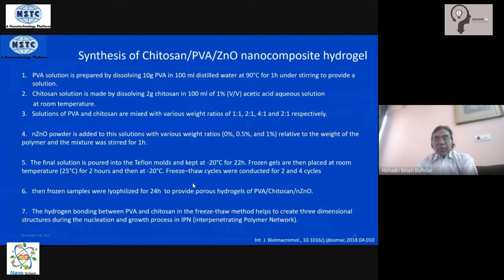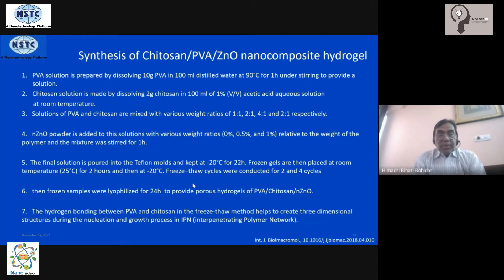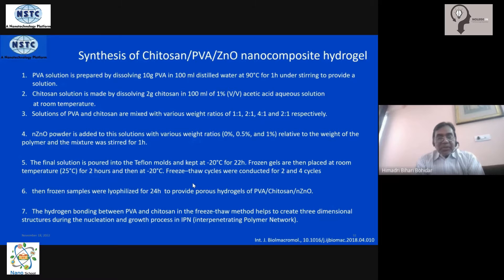Chitosan is soluble only at lower pH, so we use acetic acid to reduce the pH. Then the two solutions — chitosan and PVA — are mixed in various ratios to prepare various formulations. Now, zinc oxide nano powder is added to the mixture; this is the nanomaterial we add in solution, for a maximum of up to one percent by weight.